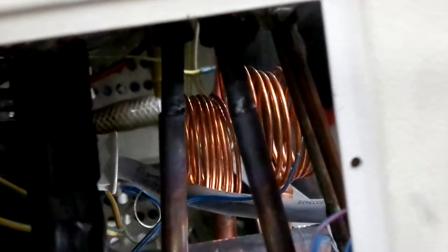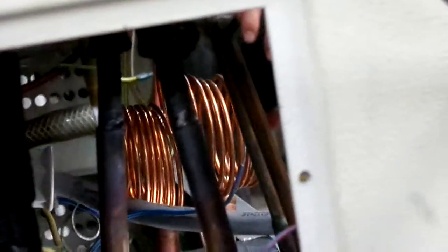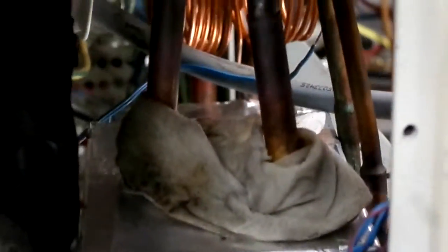Okay, a lot of times you can just put your damp cloth, shut this off for a second, you can put your damp cloth at the bottom, at the base of your E-valve, around the little rubber grommets, just to keep them cool. You don't want too much heat to get into that E-valve assembly, or again, the heat can actually damage the thermal expansion valves inside. So just put that there. The damp paper towel will take away the heat from the pipe that is going into the assembly. Get that going again.